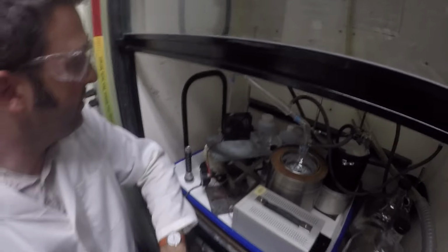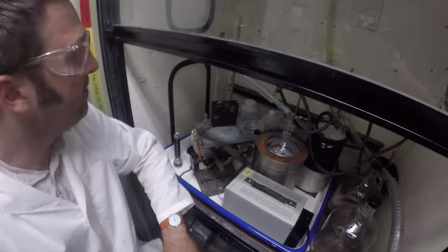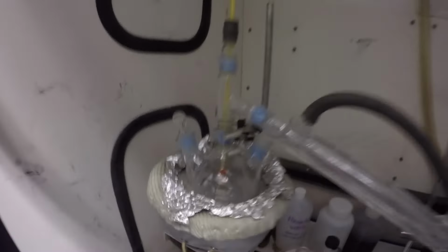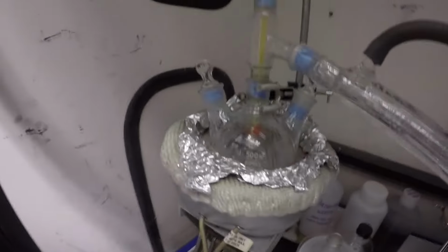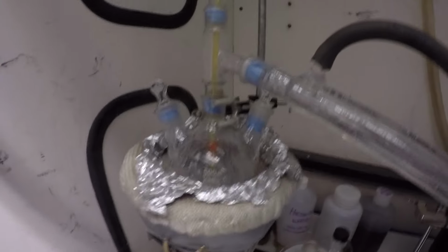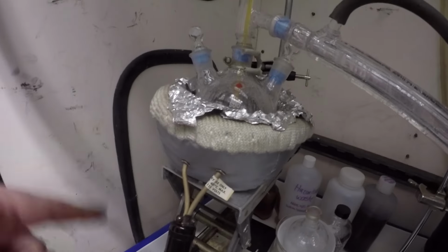So I just kind of want to get a quick visual of what we have here. So we've got the mercury in here, correct? Yeah, there's mercury in there. Okay, it's warm, so there's mercury in there, and then we're going to heat it up.